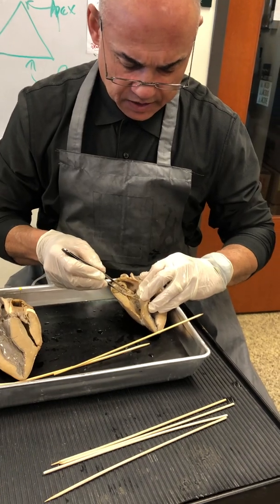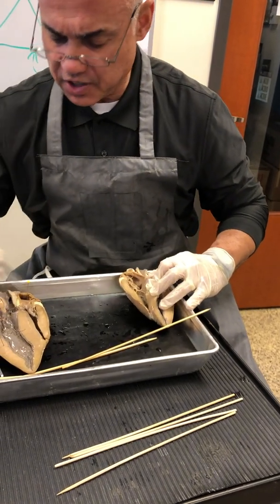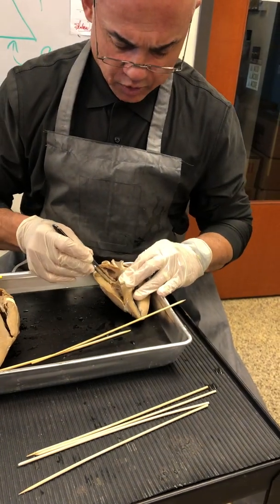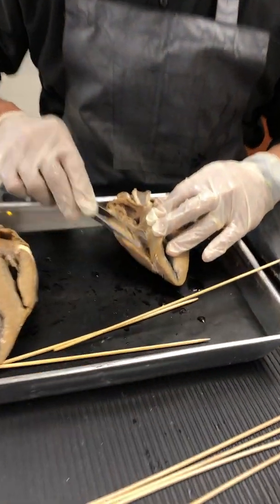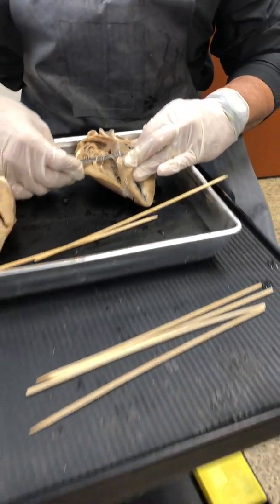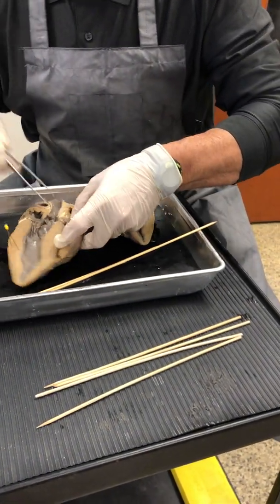And then there we see the tricuspid valve right there. There's the tricuspid valve. I don't see it. So you keep going back and forth. Notice back and forth. So there's a piece of the tricuspid valve there, and there's most of the tricuspid valve right there. Then the tricuspid valve has chordae tendineae or tendinous cords running down from it right there, and some of it right there.